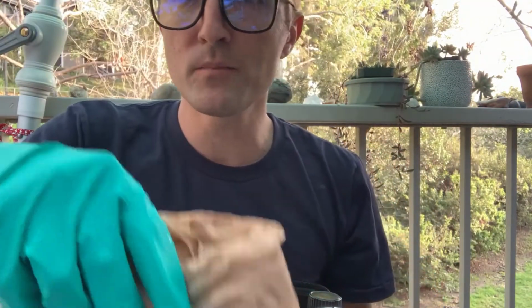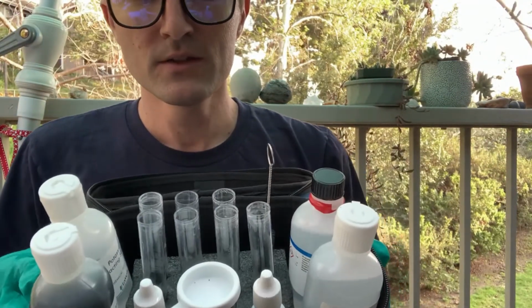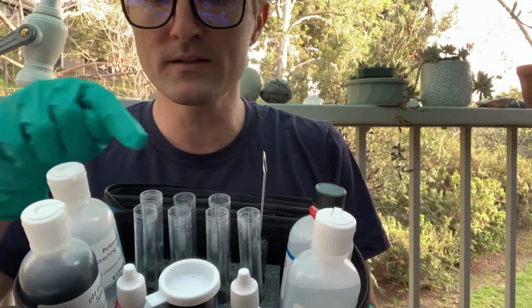One thing that will be very important is make sure you don't mix up the chemicals. So each of these belongs to a specific test, and there's enough test tubes in here for you to use different tubes for every test. I recommend you do one test completely all the way through and then go and clean up and set that material aside and then get your second test out and go through that completely. That way you'll never mix up different chemicals and get the wrong thing put into the wrong tubes.